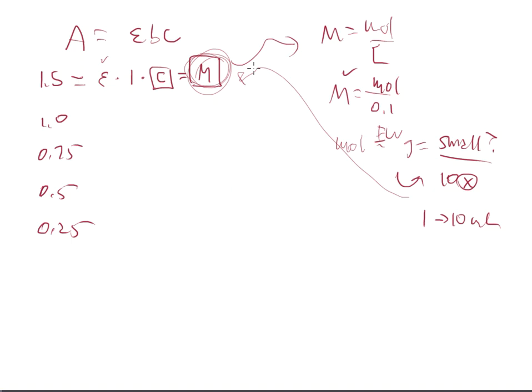So use Beer's law, figure out the concentration that you should not go over. That will be your highest standard. Then from there, figure out a way to make a caffeine standard that will be that concentration. And I will guarantee you that if you use this molarity in the molarity equation, because it's going to be so low, even if you make 100 mils of this stuff, this is going to be a very, very tiny amount. So you're going to have to go stronger and then dilute it down in order to get what you want.